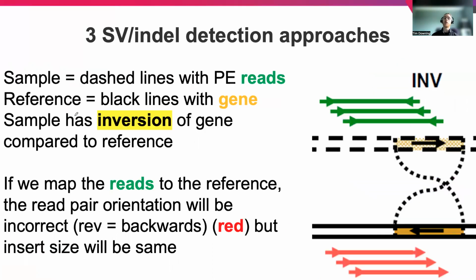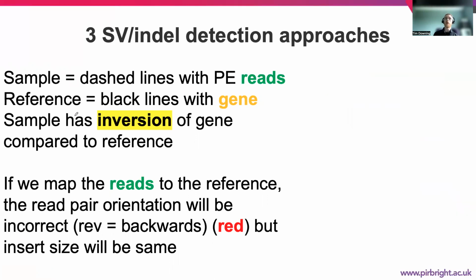So another example is an inversion. So in this case, we can imagine that in our sample, if we have an inversion, so let's take the sample we have here, and we're going to go A, C, B like that. I'm going to extract reads from here. So remember, they're the same for A all the way through. Then we have A into C and C into B. So imagine what happens to the reads when we do that.